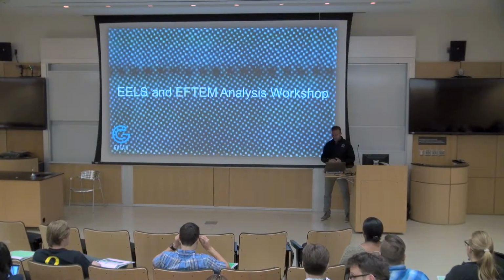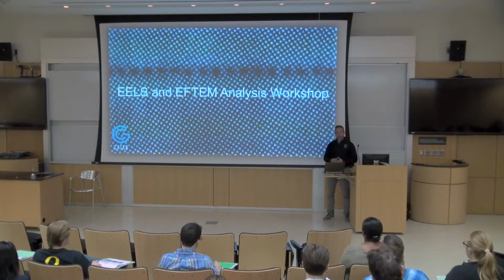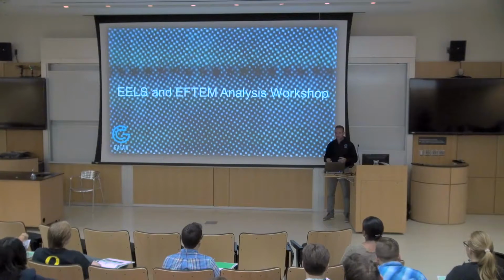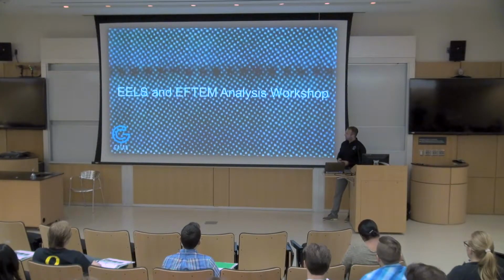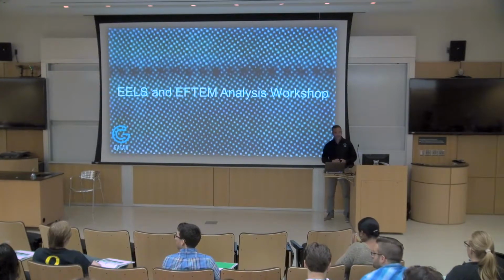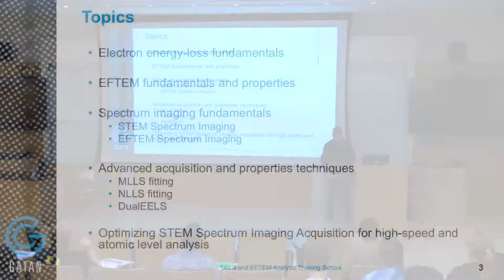So basically, this lecture will be pretty broad, about EELS. So you're not going to see much math involved. It's a very general introduction to EELS, which means electron energy loss spectroscopy, and EFTEM, energy filtered TEM. These are all techniques that we'll demonstrate in the lab over the next few days.